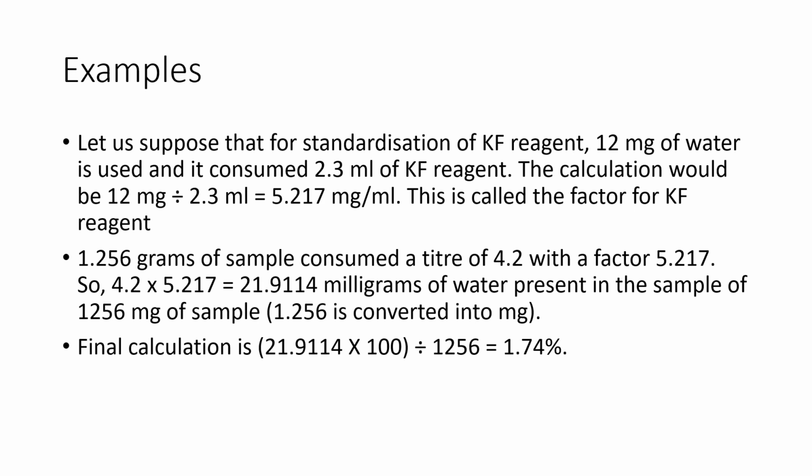There are several methods described in pharmacopoeia. Most of the time, the direct titration method as described in this video is used. You can read USP chapter 921 or PHEUR, that is EP 2.5.12, or Indian Pharmacopoeia IP 2.3.43 for more details. I hope that you understood the subject well and the intent of Karl Fischer titration methodology is understood well.